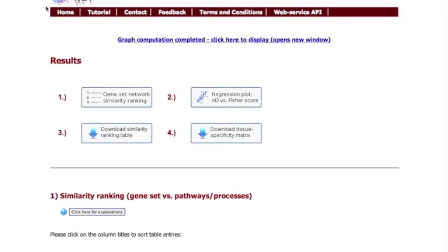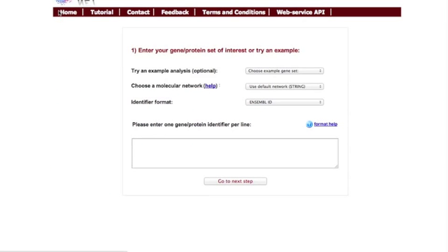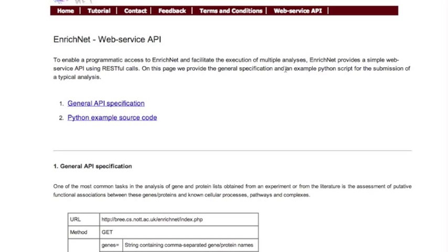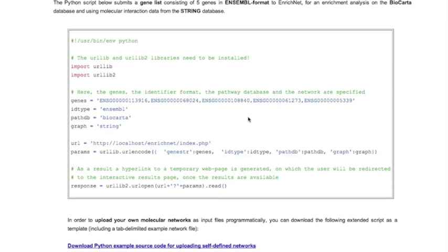By returning to the top of the page and clicking the home button, you can submit a new gene or protein list of interest. If you prefer a programmatic access to the software, you can alternatively use the web service API. A Python example source code will help you to get started.